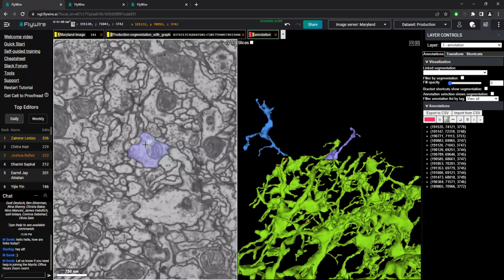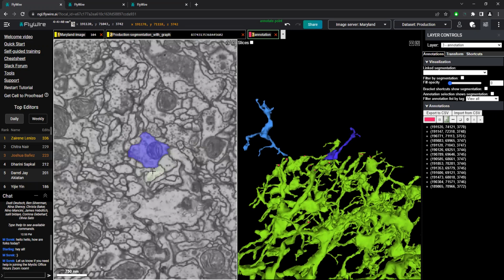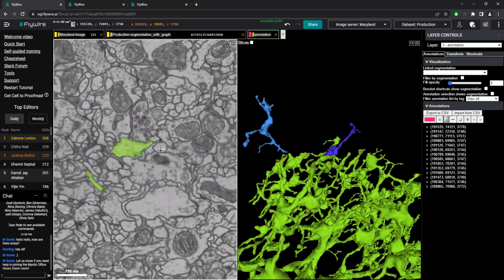And then when we move, we see that that's grown into being this, I think, mitochondria or endoplasmic reticulum, which is ER, popping up here. And we also know it's good because we have these 3 little nestled areas here. So if we go back to our green, we can see that we have these main little parts all coming around underneath it.